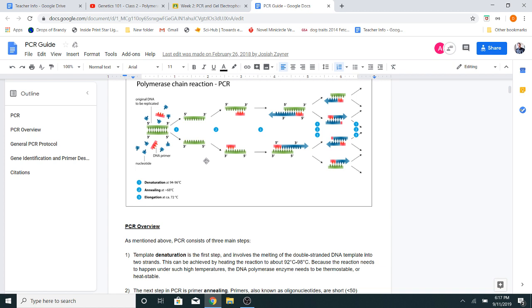So when you have all those ingredients, you can use that. Since all that's pretty standard, that's not something you change up very much. You need to decide which polymerase you want to use, and there are times when you might want to play with the particulars of that set of reactions. You may want to say, oh, it needs a little bit more of this, or a little bit less of that, but that's very rare. Mostly you just use the master mix in the standard way, and it generally works pretty well.